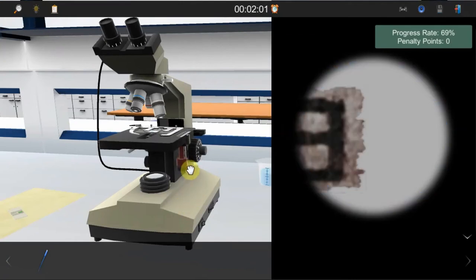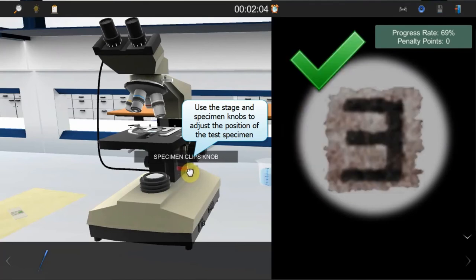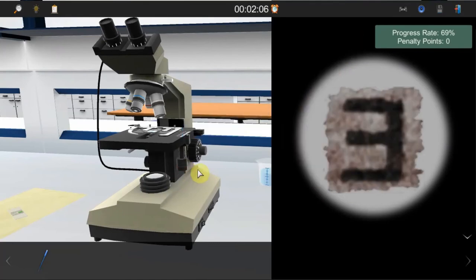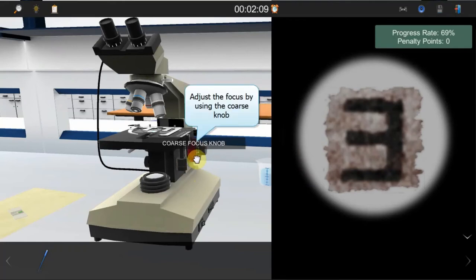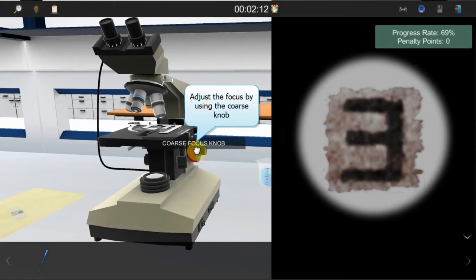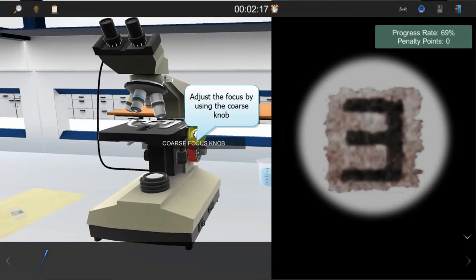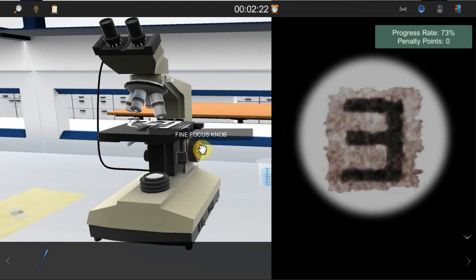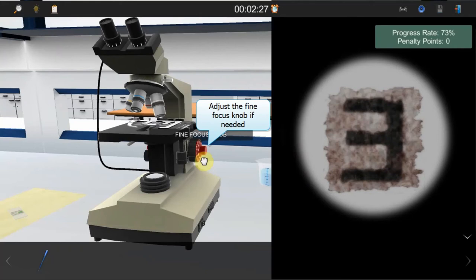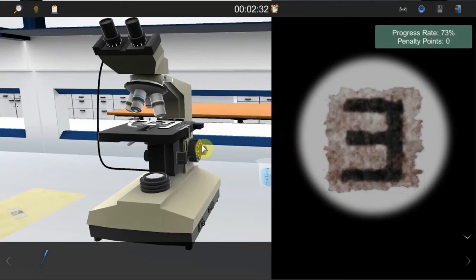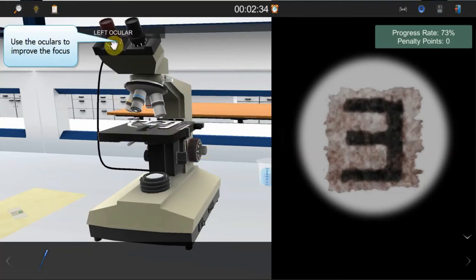Use the stage and specimen knobs to adjust the specimen position if needed. Now try to focus on the specimen by using the coarse focus knob. When the image comes to focus, use the fine focus knob for more adjustments. Use the left and right eyepieces to find the appropriate position.